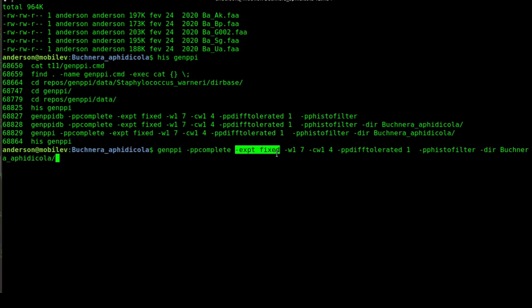The counterpart of xp-fixed is the xp-dynamic, for example, with the parameter -WS3. It conducts a systematic expansion of window limits when analyzing a CN. However, dynamic growth has a time consumption proportional to the WS value.